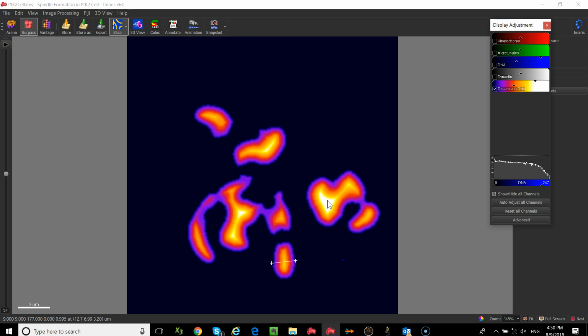Okay. So this is basically what we refer to. When you move your cursor around in the slice view, it's effectively like a voxel spy. You're basically putting your cursor on a particular pixel, and it's reading out the intensities in this bottom corner. So the intensity information for that last value is distance in microns from the closest edge of the surface, okay?